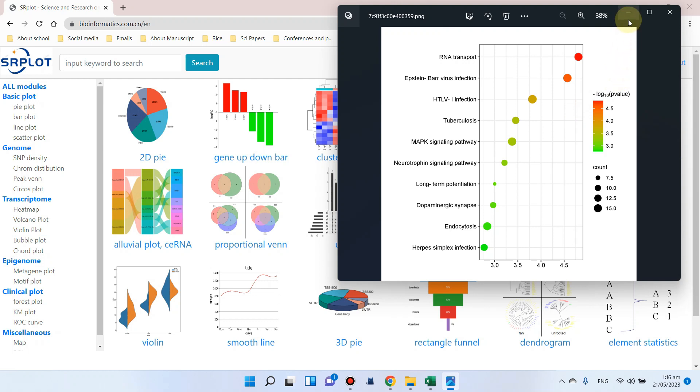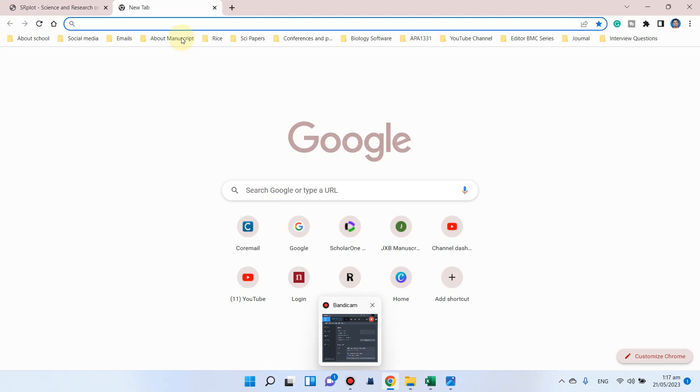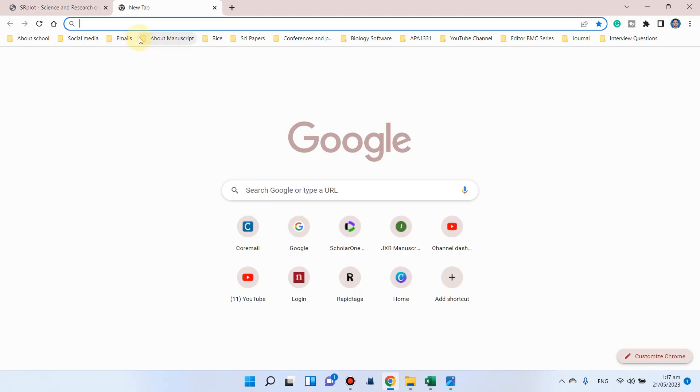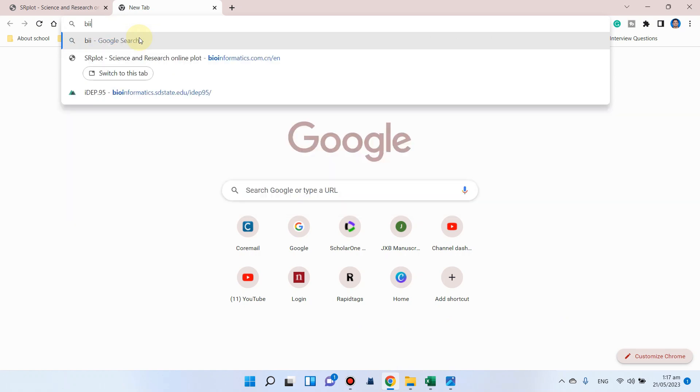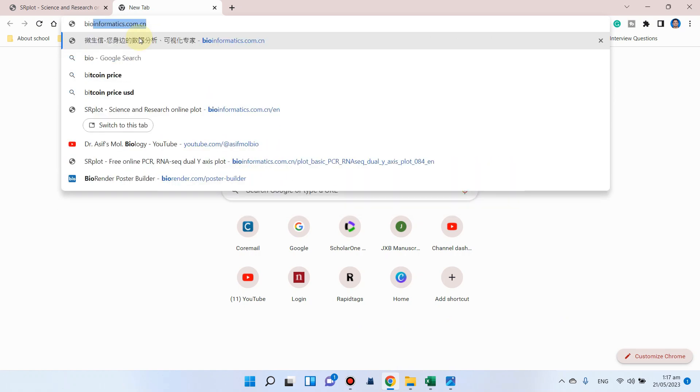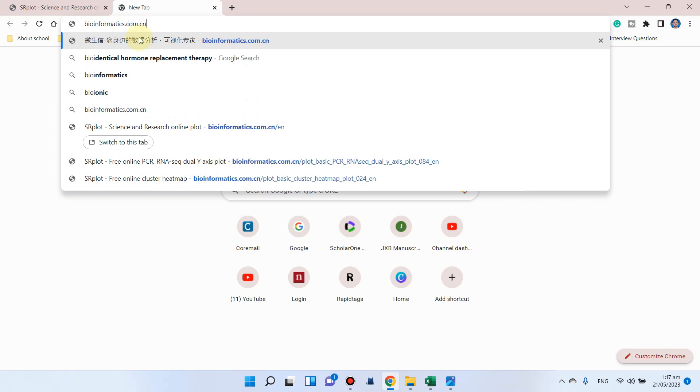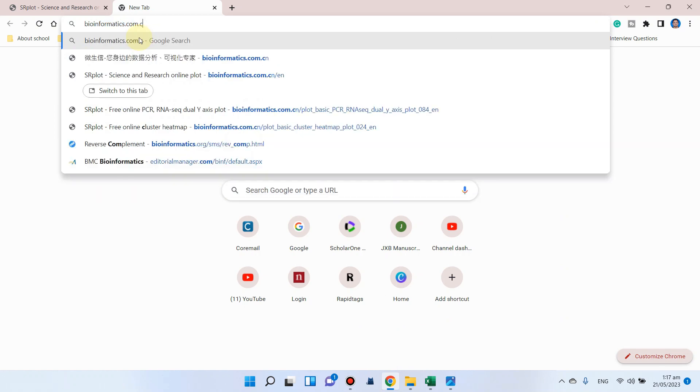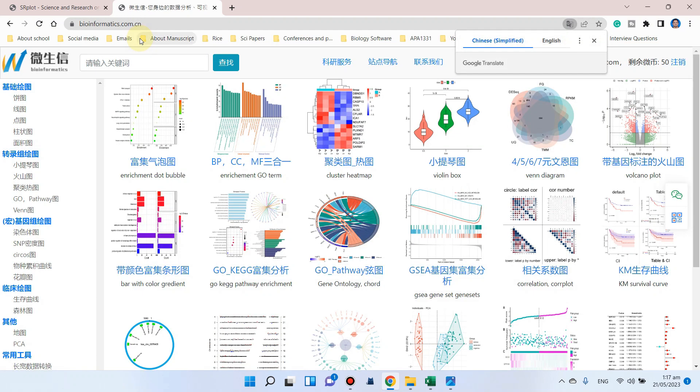The web tool name is SRPlot. Let me show you how we can access this website. Simply write bioinformatics.com.cn.